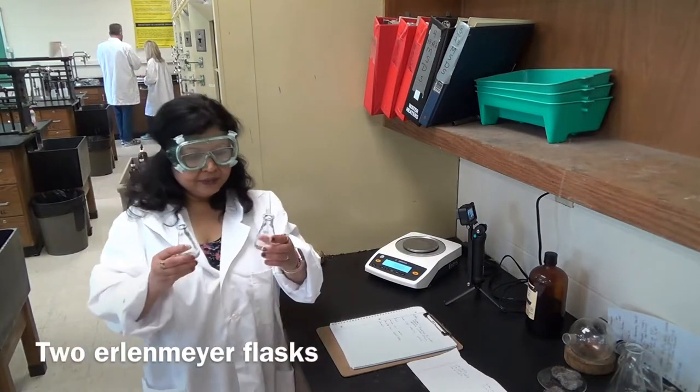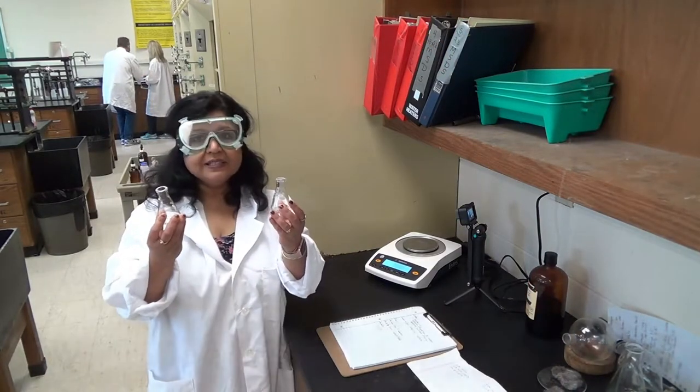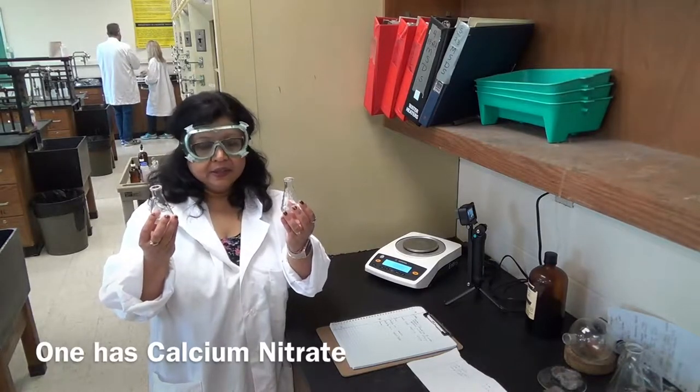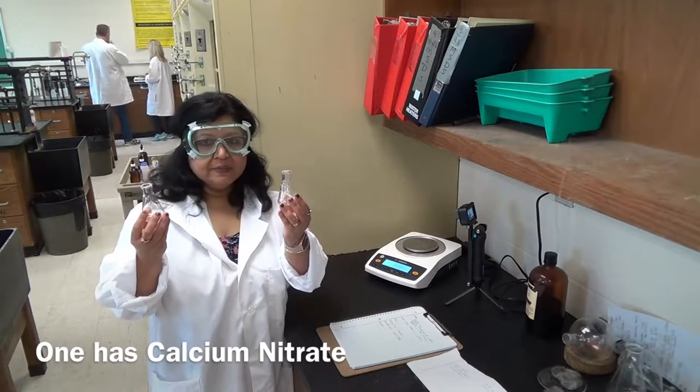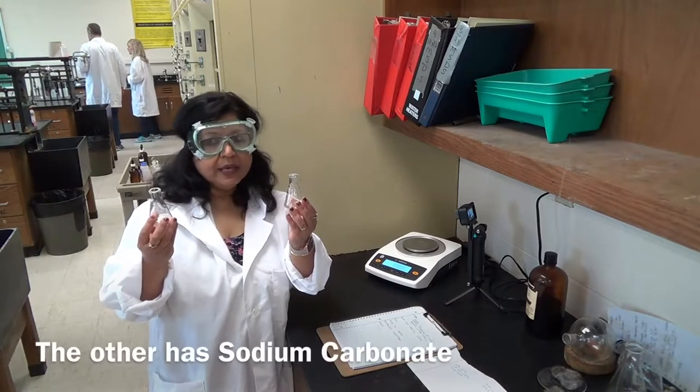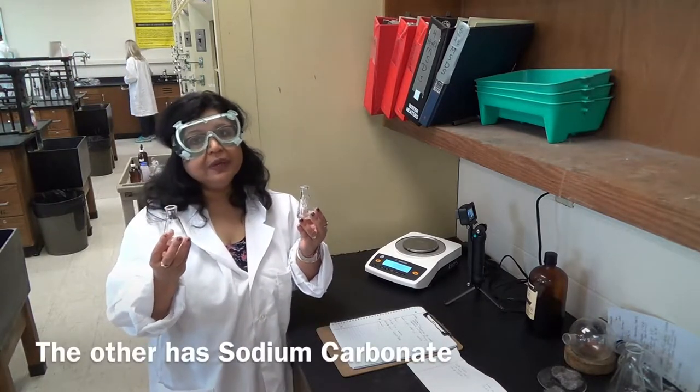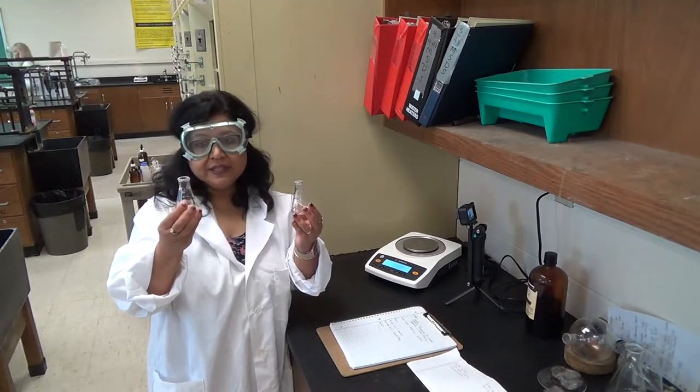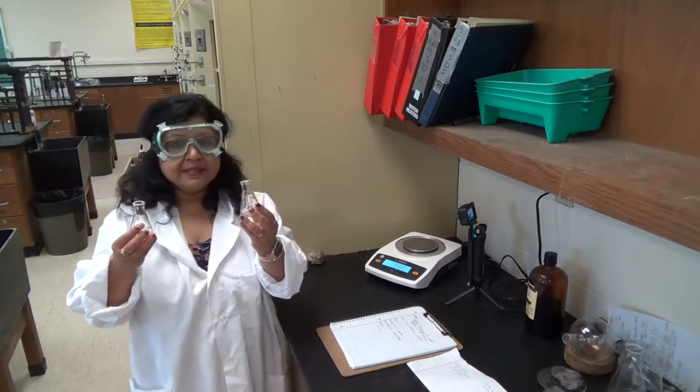Hi class. I have two Erlenmeyer flasks, and I have two chemicals in here. One I have is calcium nitrate of a certain volume, and one is sodium carbonate of a certain volume. Now I'm going to mass each one of these and see what their masses are.